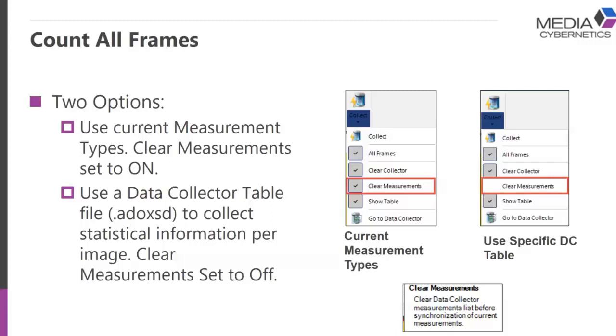I don't care about each and every little thing, whether it's tissue, whether it's particles, whether it's counting droplets, whatever it may be. I don't care about all the raw data. I just want to know the statistical information. So this is the way we'll use it to set up collecting specific statistics. And this will be off.